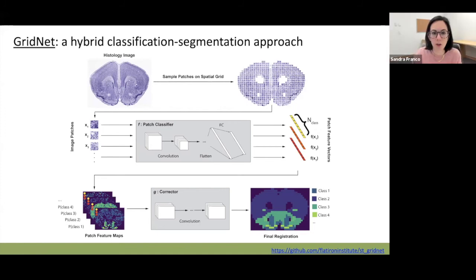I think Joy Otten is raising a hand, so you can unmute yourself. Okay, thank you. I have a question additional to this. I was wondering if you were able to use GridNet on Visium slides wherein the boundaries aren't clear, so they basically go over the grids. You mean where it goes beyond the bounds of the Visium array? Yes. So we did. Maynard had put out a data set of about 12 human DLPFC tissues, all of which exceed the bounds of the array. So yes, it is able to be applied in those situations.